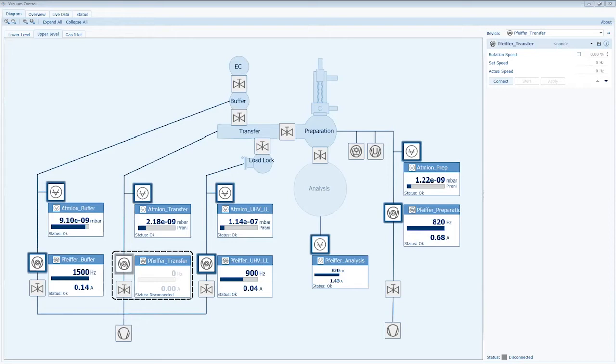Okay. So you are now waiting for the pressure to reach the right level? Actually, the pressure is already good. I mean, everything is pumped, so we can start to move the sample down. That's what I wanted to show you. To send the sample down, you can see here is kind of a diagram.